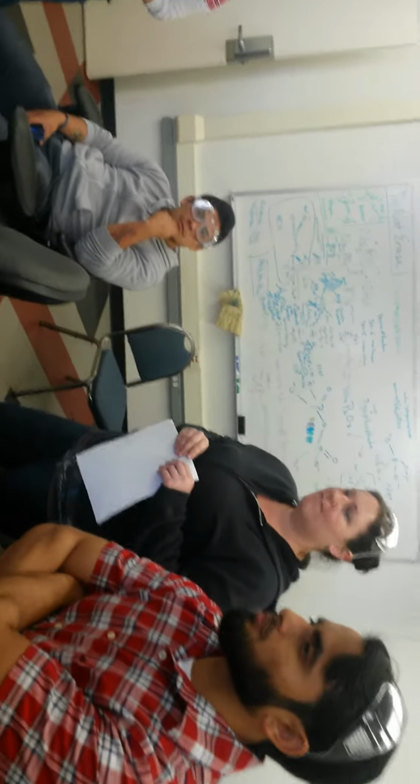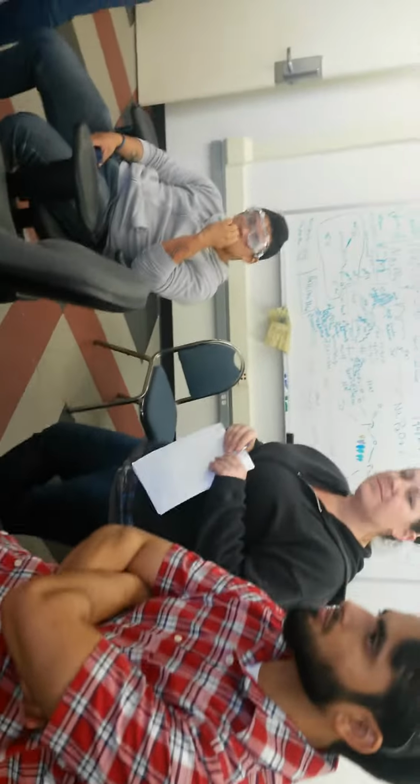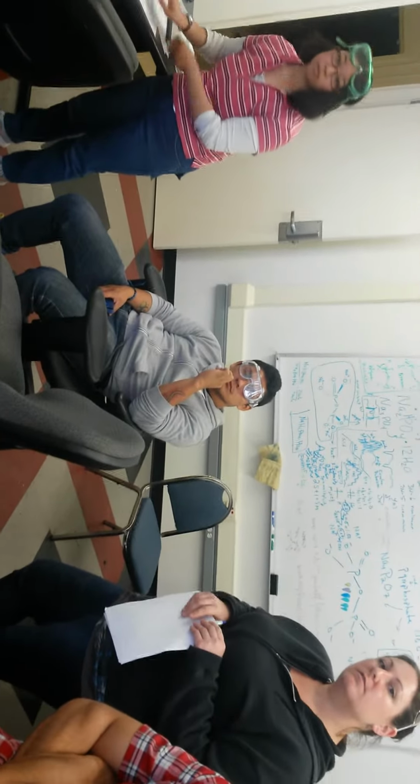Like I said, don't even worry about that. That's the advantage here: it'll be here for you, ready. So if you want to come back on Friday or tomorrow, you can, because we'll be here. I want to start working on it Tuesdays. Okay, that'd be cool. The best way actually is to put it on the cloud. So basically, you guys can just log in from home to here, and then boom, just get it without even having to worry about USB or anything like that. That's another part we're trying to cut out.